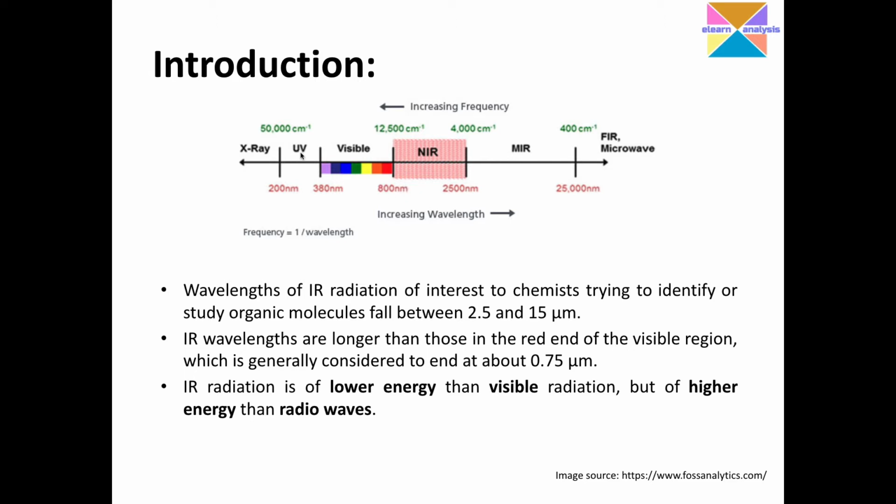As you can see here, we had already discussed ultraviolet and visible spectroscopy in the previous two sessions, where we discussed ultraviolet as well as fluorimetry. The wavelength region for these two electromagnetic radiations starts from 190 or 200 nanometers up to nearly 1000 nanometers. Practically, we define them as 200 to 400 for ultraviolet, and 400 to 800 for visible. So visible radiation is of longer wavelength, whereas ultraviolet radiation is of shorter wavelength.